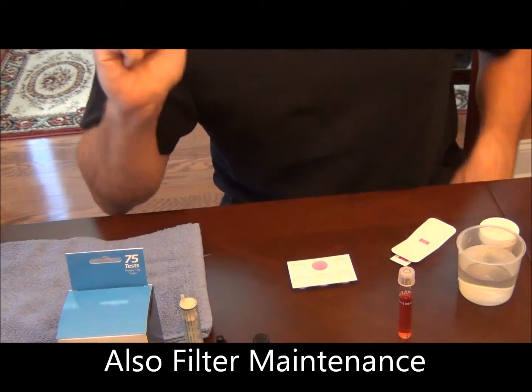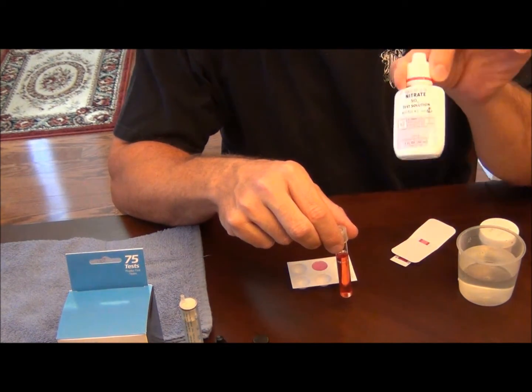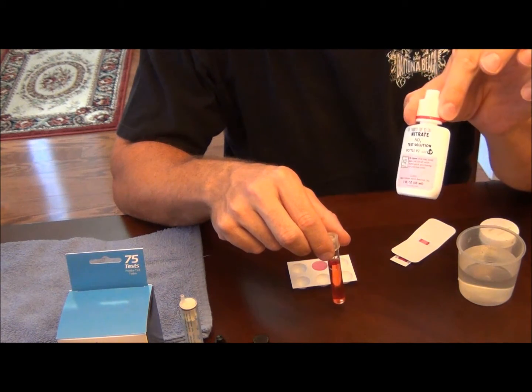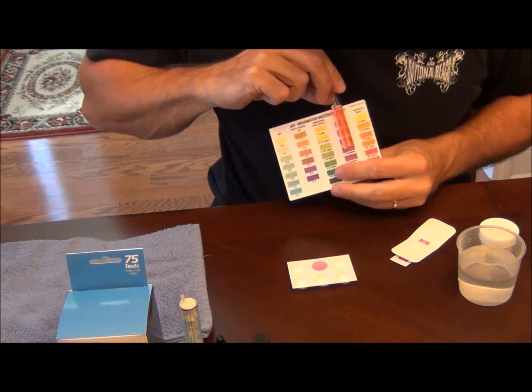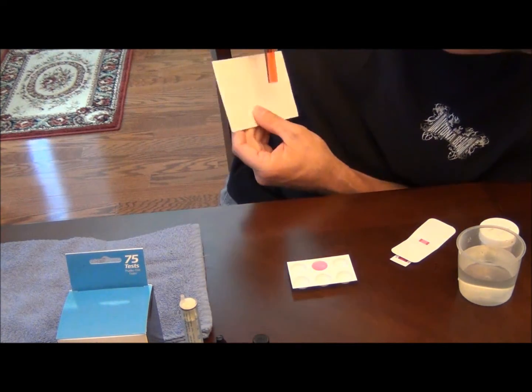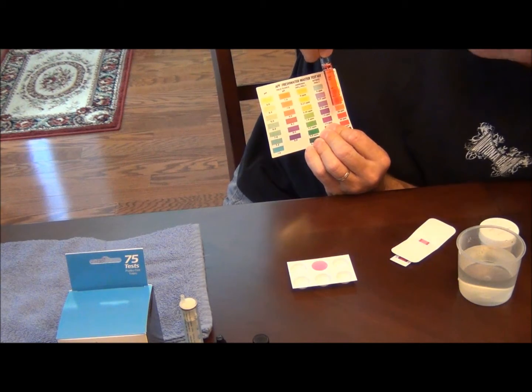I don't know if it's been five minutes yet, but let's go ahead and take a look at the nitrate test. A lot of you doing your nitrate test — remember there is a second solution that you have to add to the test tube. Don't just add the first one; you have to shake the second one vigorously. Right now it is about 10 parts per million with the API test kit.